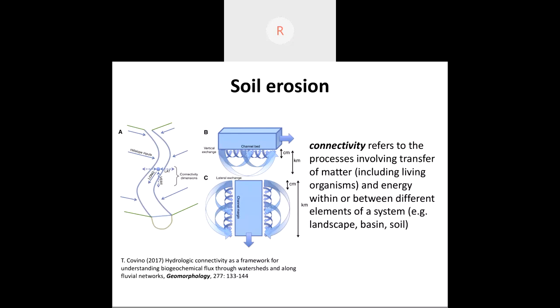Also, the amount of organic matter changes if soil is contaminated or eroded. So, as you see, we have to monitor soil erosion by using many different and sometimes very difficult to understand techniques. So the idea is, why not use fast field cycling NMR relaxometry?